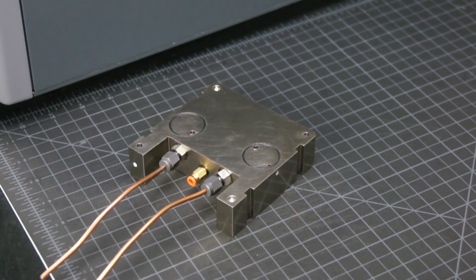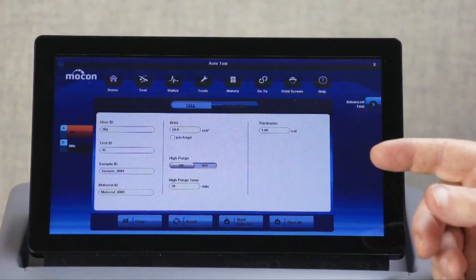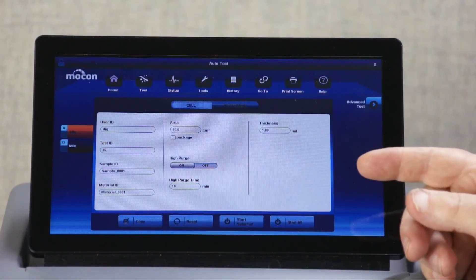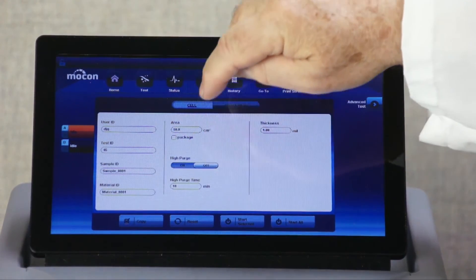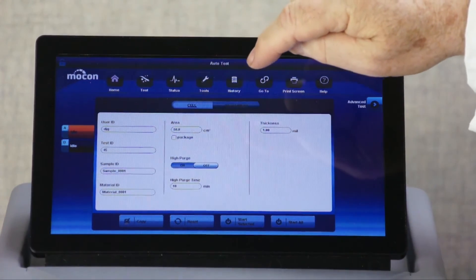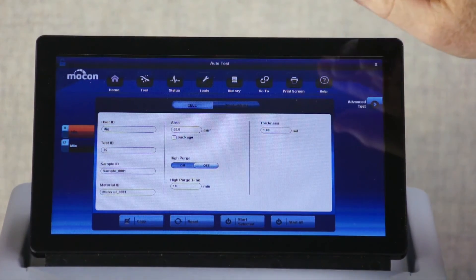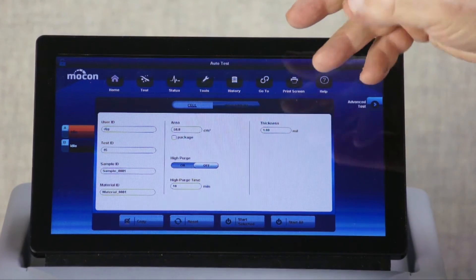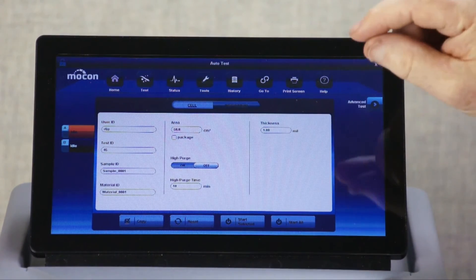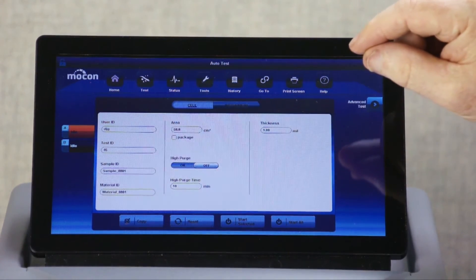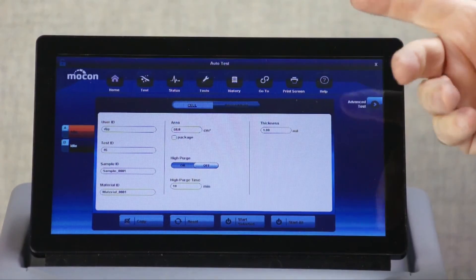To speed up package testing, we have a high purge cycle which quickly purges the package of residual oxygen so the test can start much faster. As an example, a 3-liter package should be ready to test in 12 minutes compared to several hours.